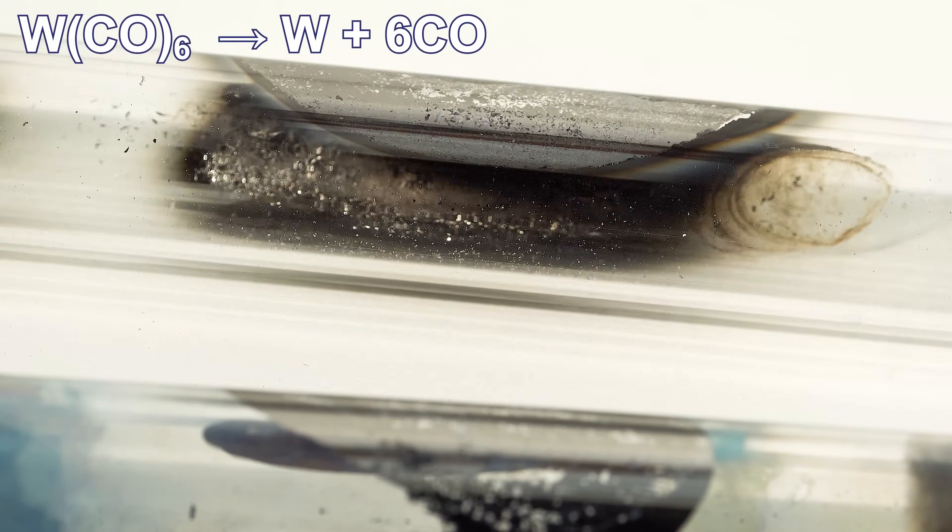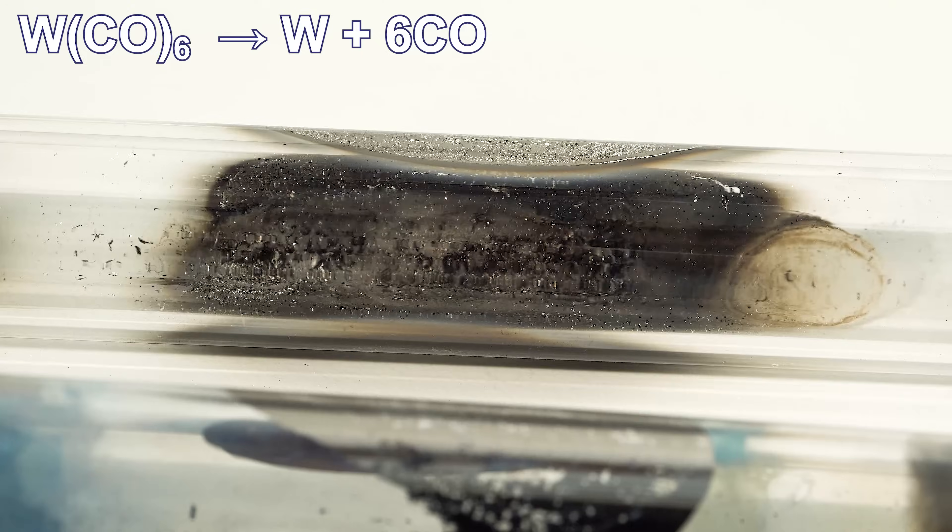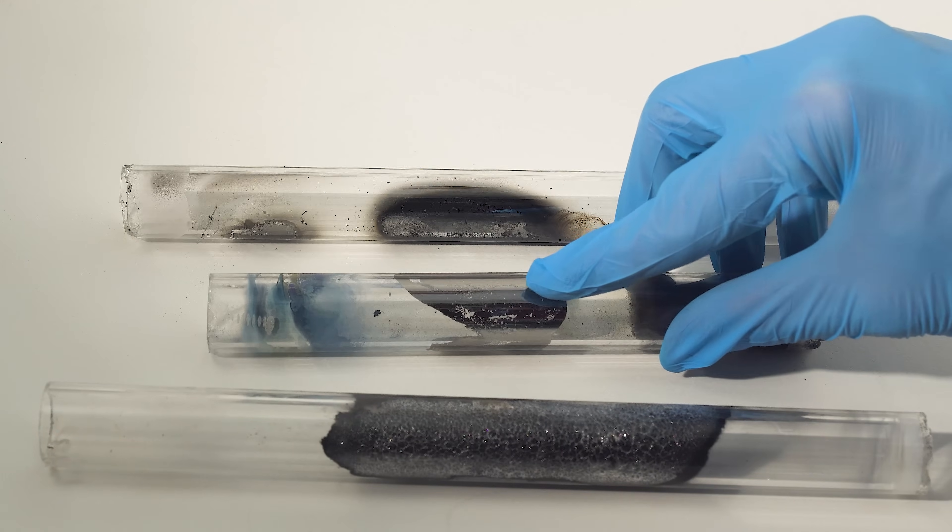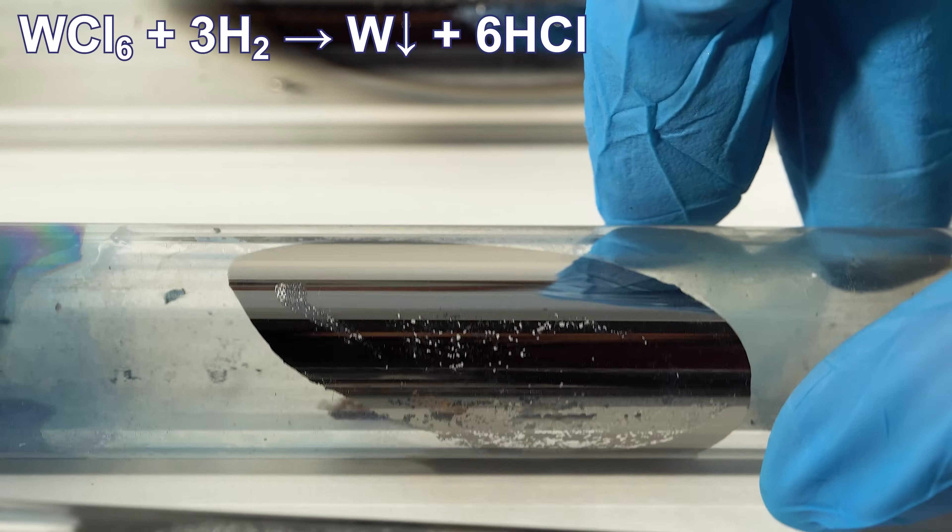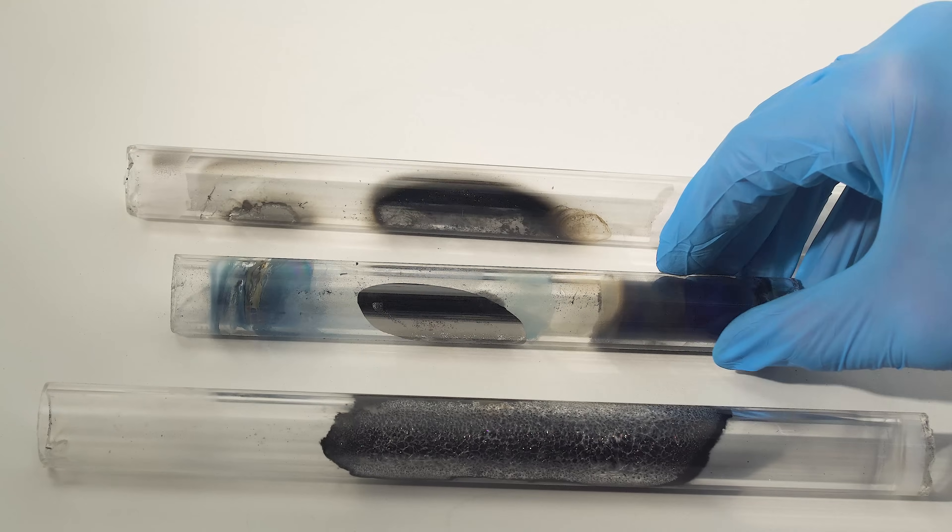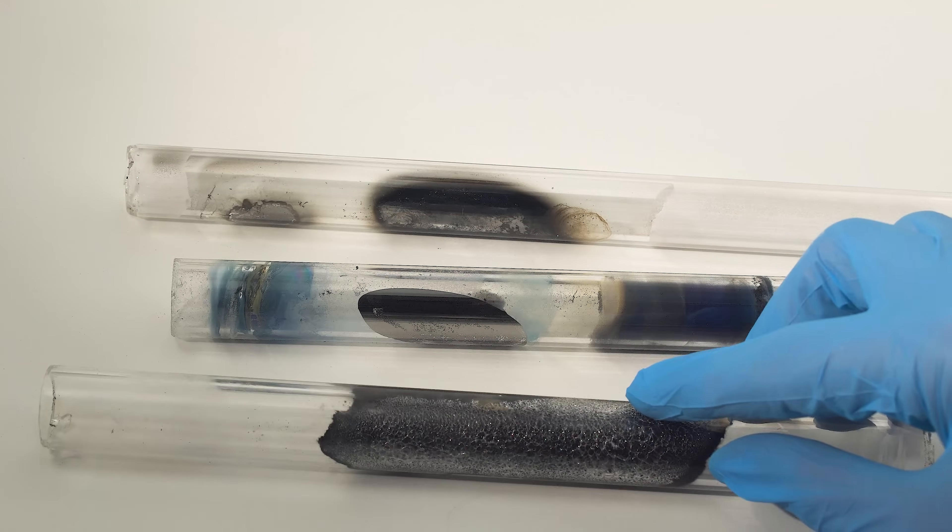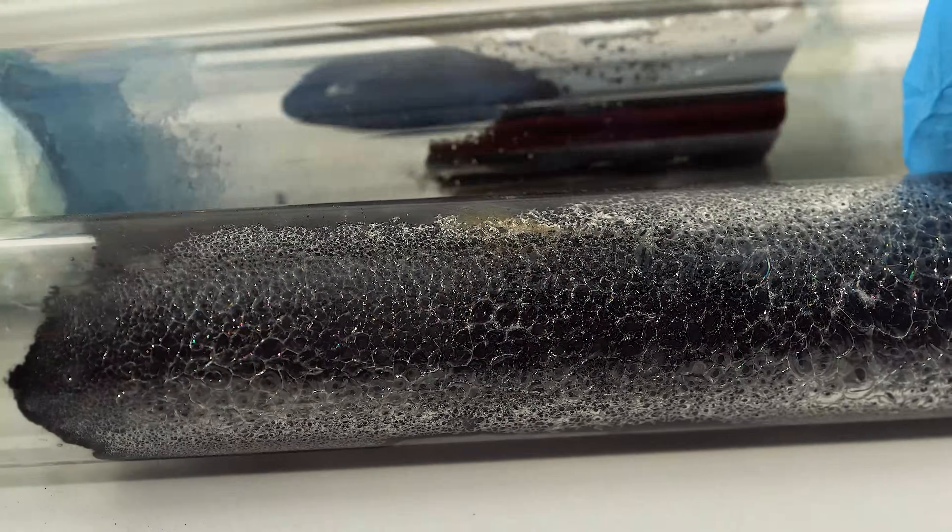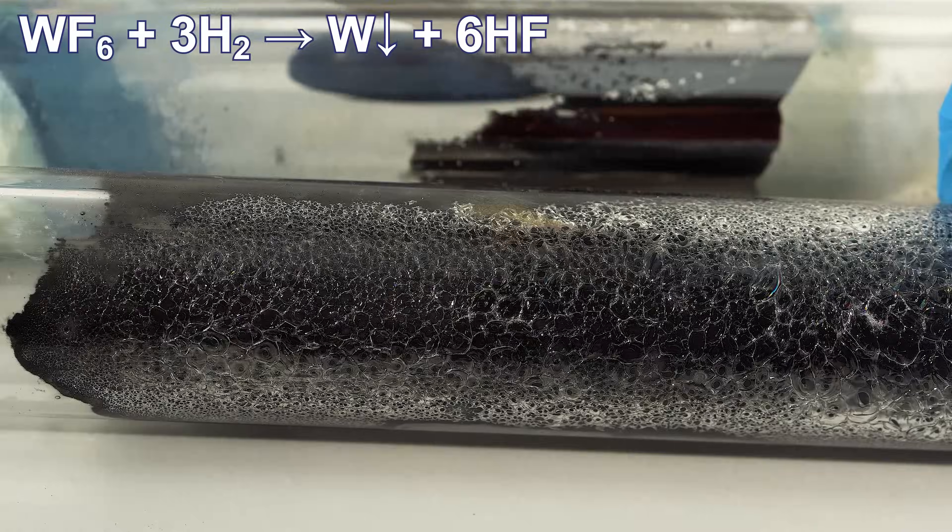I obtained this mirror by decomposition of tungsten hexacarbonyl in an inert gas atmosphere. This tungsten mirror was obtained by reacting vapors of tungsten hexachloride with hydrogen. And this tungsten coating was obtained by reacting tungsten hexafluoride with hydrogen.